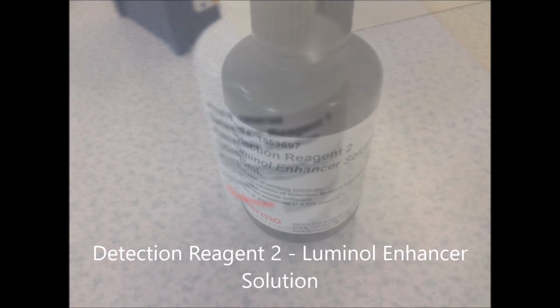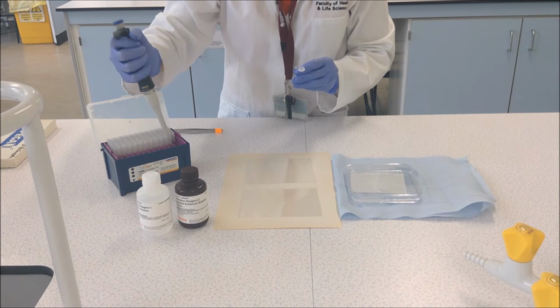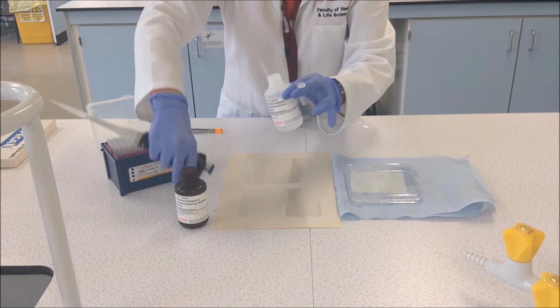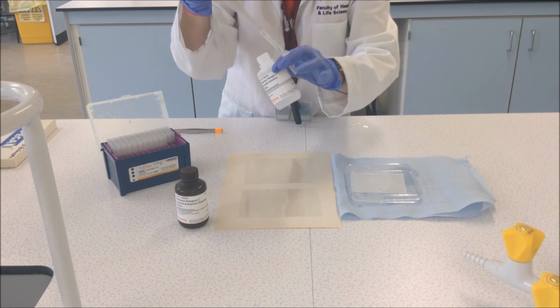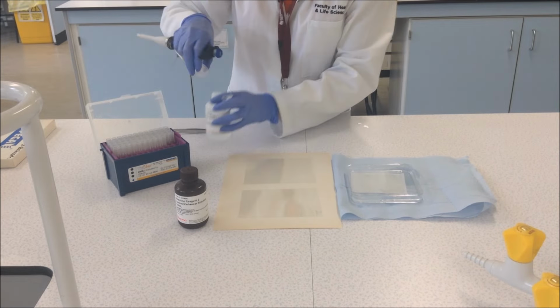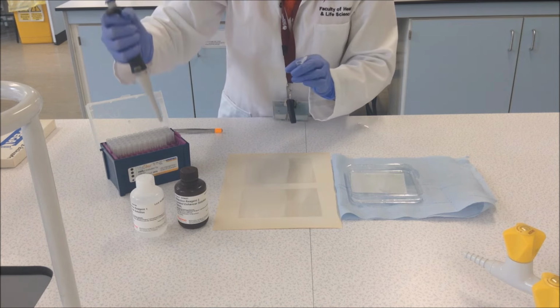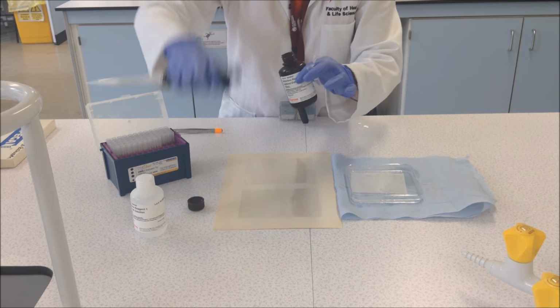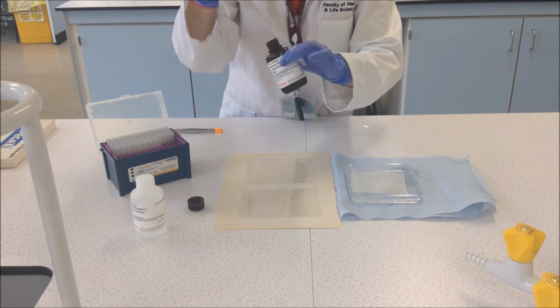So for the next step, we're going to need 2 reagents. We're going to need detection reagent 1, peroxide solution, and detection reagent 2, luminol enhancer. So here, measure out approximately 250 microliters of detection reagent 1 and pour this into a microcentrifuge tube. You are then going to need an equal volume of detection reagent 2 and then carefully mix these 2 reagents together in the microcentrifuge tube.